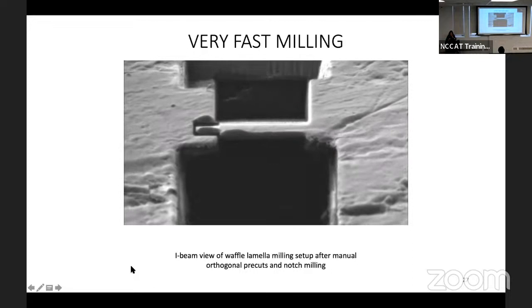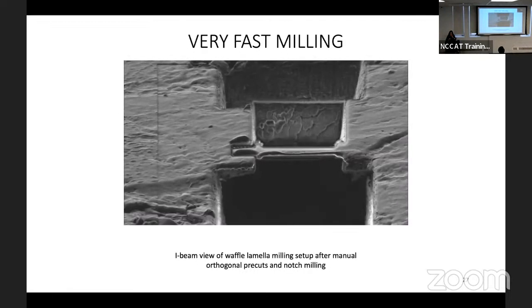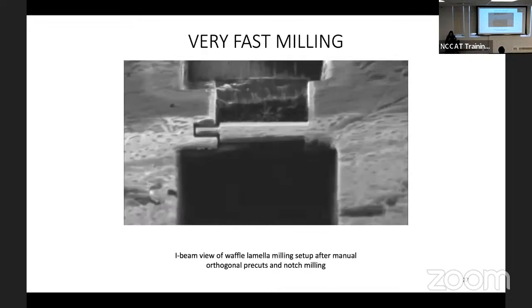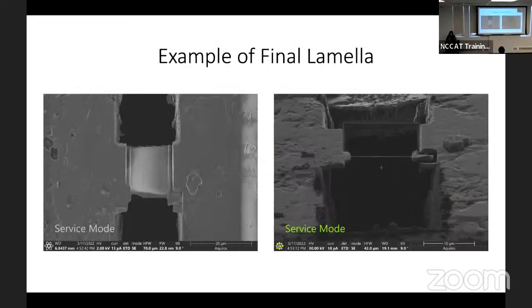So, very fast milling. Obviously it doesn't happen this fast. This is sped up, but it's just a quick video of what AutoTEM actually does. And then you're left with a lamella. Great. So this is an example of one of the lamellae that we will get afterwards.